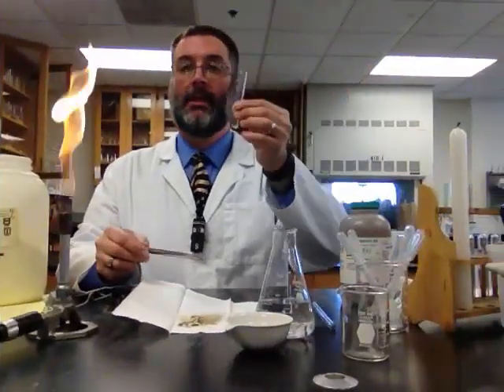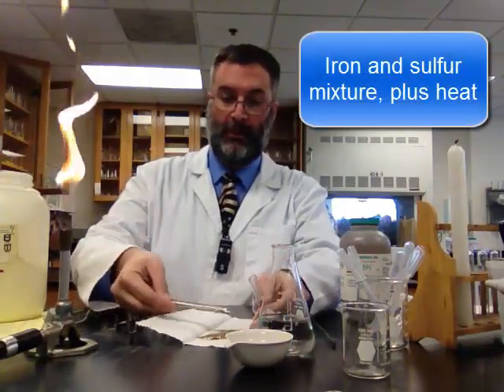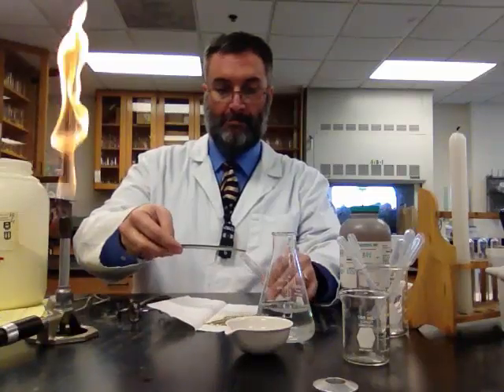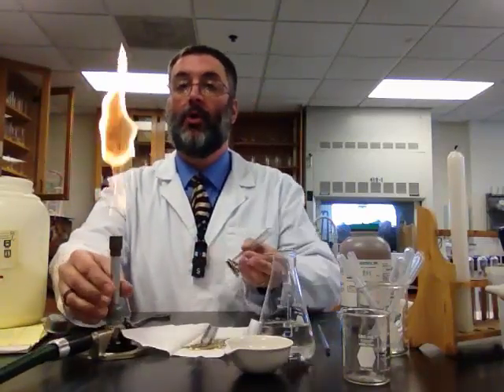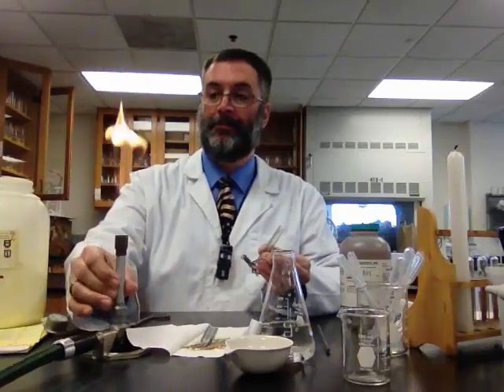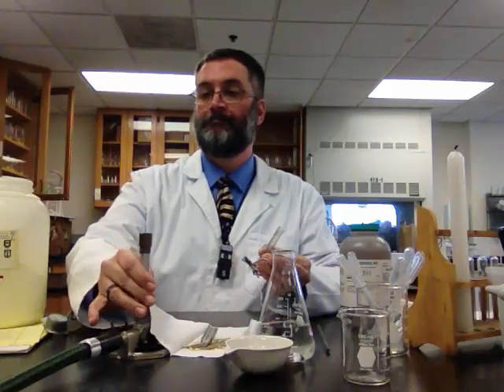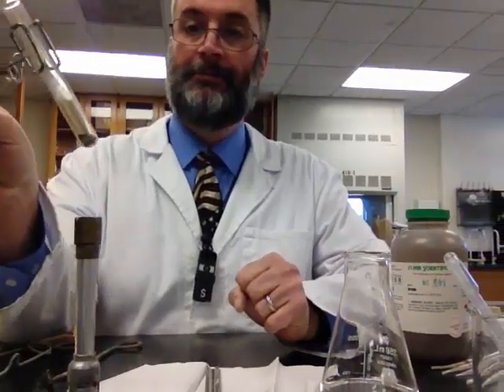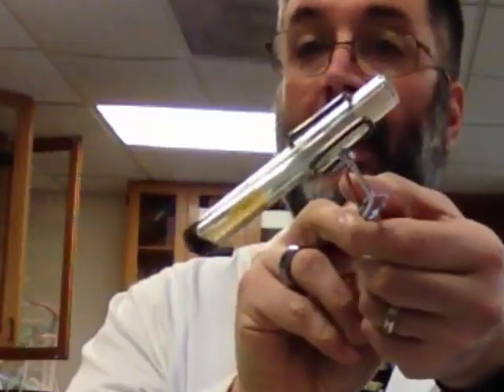Number 2. Test tube. Take a small amount of this powdered iron and sulfur mixture and place it in the test tube, like so. I am then going to hold this over a burner flame. Let's see if we can get you a little closer. I'm going to put this over the flame now. Watch for any changes that you see. See anything happening?